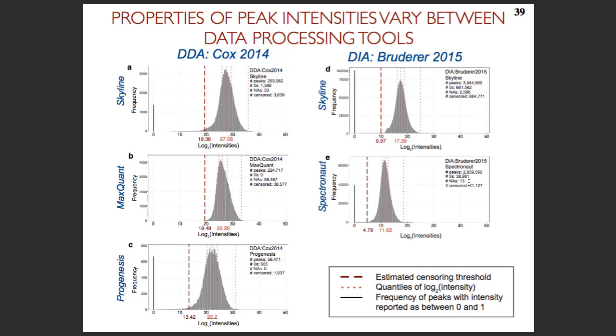So, for example, Skyline tries to distinguish peaks which are below the limit of detection and peaks which cannot be quantified reliably. So, for example, if a peak is there but it's heavily overlapped with another peak to the point that you cannot get the integration, they will report NA. But if the peak is very small and below the limit of detection, they will report a very small value of 0. Also, another situation when they cannot integrate the peak is when you schedule a transition incorrectly, and most of the peak is outside of the scheduled window. So you see the peak is kind of there, but you can't quite integrate this, and they'll report NA. So essentially, zeros and NAs for Skyline distinguish missing at random versus missing due to low abundance, being below the limit of detection. So Skyline, in our experience so far, has been the only tool that actually distinguishes that.